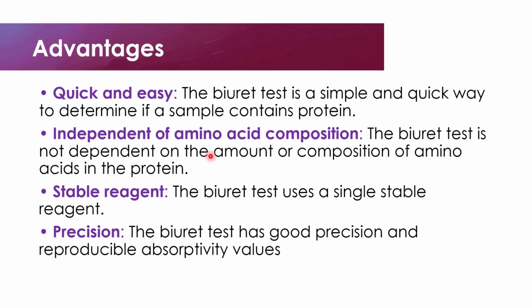And the third advantage is that it has a stable reagent, as the Biuret test uses a single stable reagent, and it has precision. Over here, what we have to note is that the Biuret test has good precision and reproducible absorptivity values. So these are some of the advantages of the Biuret test.